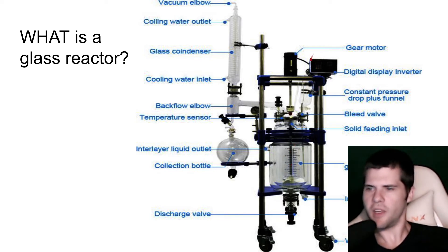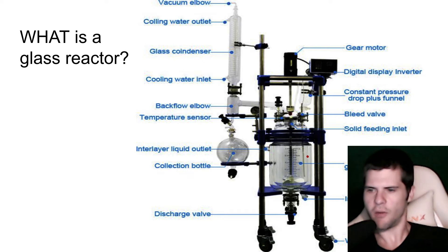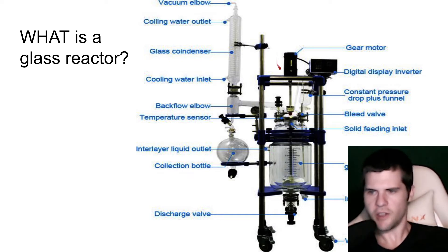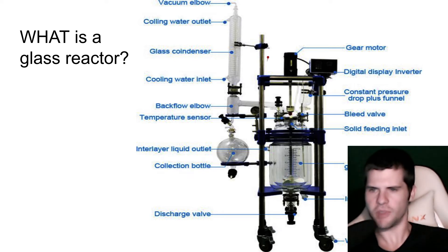Right here is what we will have — it's a digital display inverter, so this is going to tell us our stir speed, our vacuum pressure, and our temperature from the thermometer. It will all be reading right here on the back of this display module. This right here is what we call an overhead stir motor or a gear motor. It's connected to a PTFE stir rod, which will actually allow us to homogenize the reaction inside.